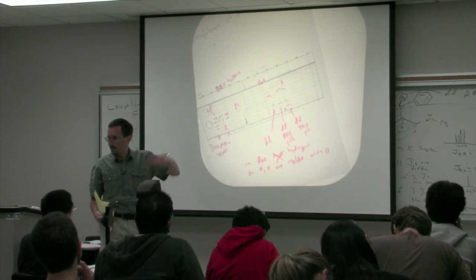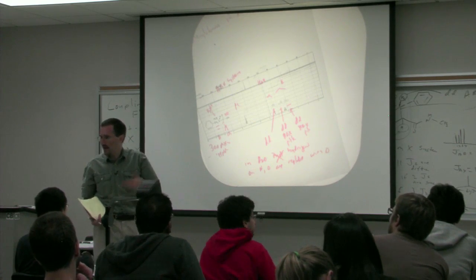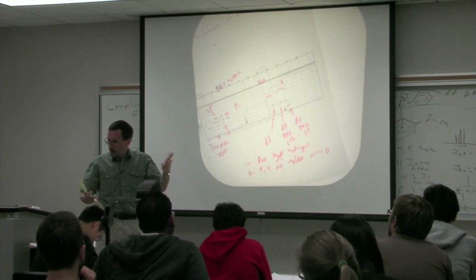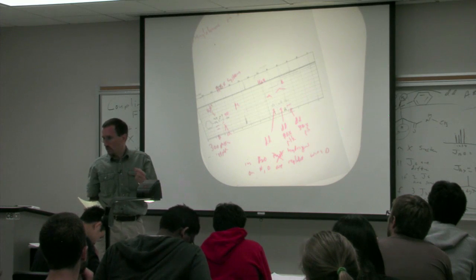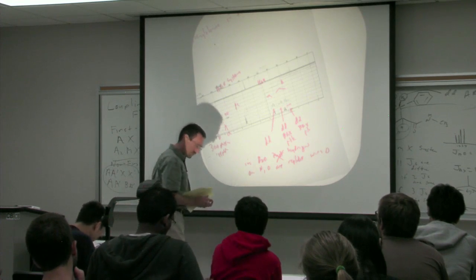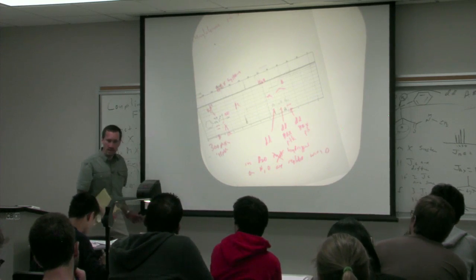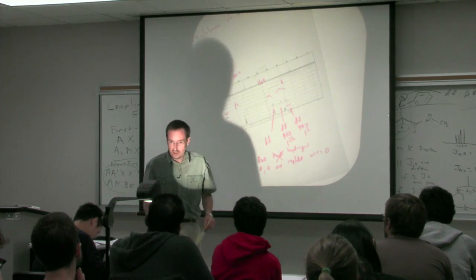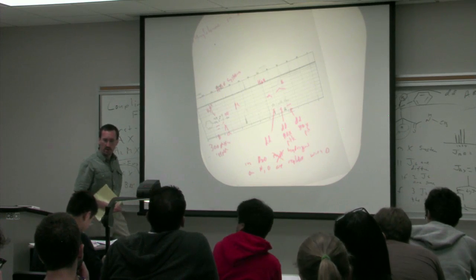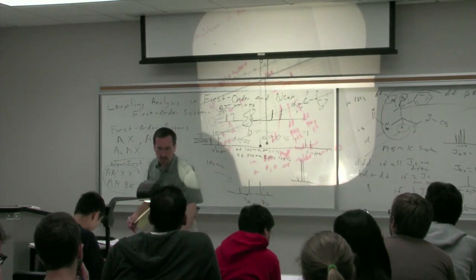Deuterium doesn't show up at 500 megahertz, but at a much lower frequency. So they don't show up in the same spectrum, and the J values are so small that for all intents and purposes you don't see coupling, plus they're exchanging very quickly. Even without DCl, they will exchange. Because of DCl, the amine is protonated, so the amine is an ammonium group. And because of DCl, it dissolves, whereas phenylalanine in just pure water wouldn't be nearly as soluble.